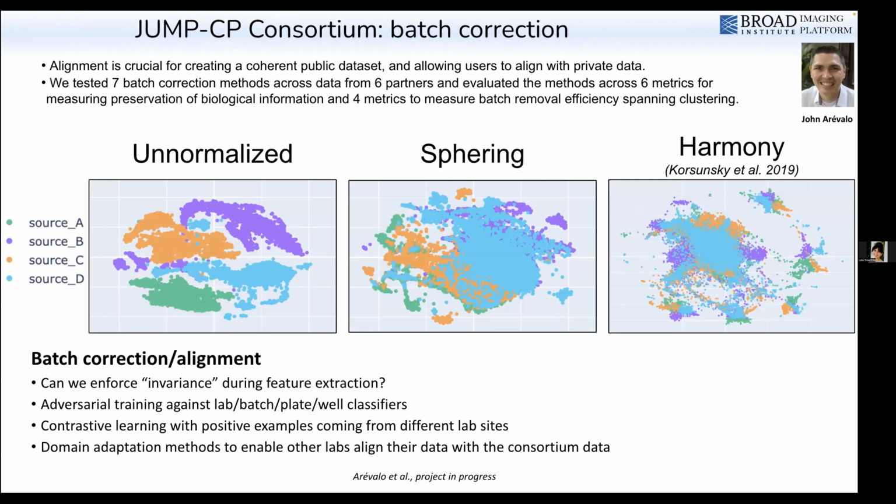One such ongoing effort in our lab is to develop batch effect correction methods, for the most part by just repurposing successful techniques from the single-cell RNA-seq community, where there's been a lot of activity on this front, as some of you might know. Batch effects, especially in high-dimensional biological readouts, can really blur out signal. And our effort here is to come up with strategies that would allow both correcting for batch effects, but more generally integrating data across experiments so that the large data set that we've built can be something that others can easily build upon.